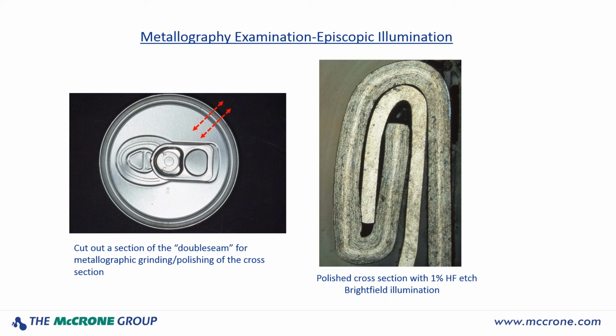So we can see the strain structures of the aluminum as it's going around these bending and pressing processes. And you'll notice down at the bottom of the image there's a slight kink that has formed here at the very bottom, and we can see that there's some strain pattern going on. And this is a possibility now for some residual stresses that could be in this area that might eventually lead to a crack.